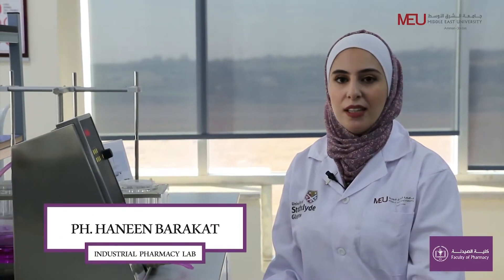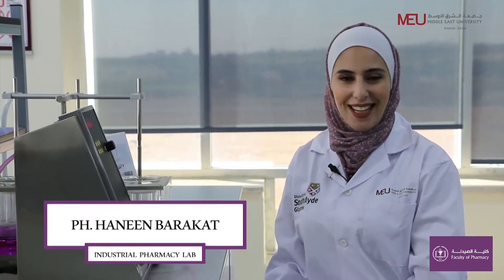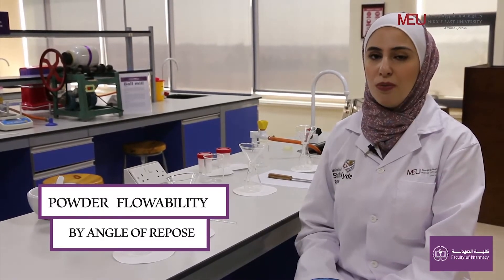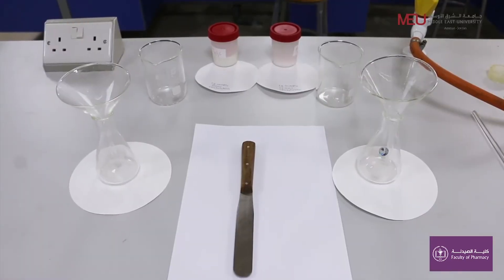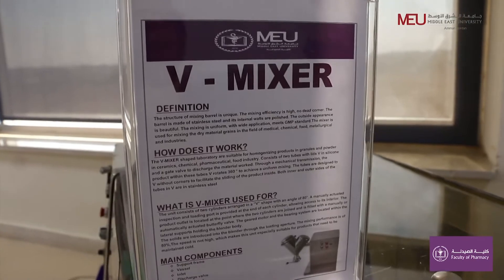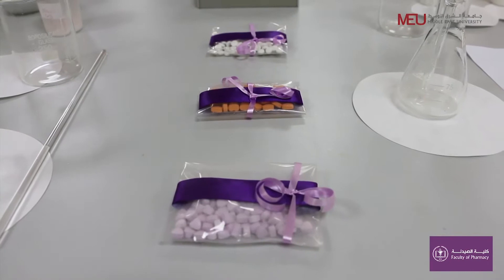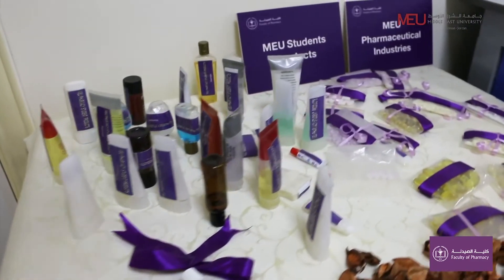Welcome to the Pharmaceutical Industrial Lab from Faculty of Pharmacy, Middle East University. This is Pharmacist Hanin Barakah. Our experiment is about mixing of powder by three different techniques: spatulation on paper using a spatula, trituration using mortar and pestle, and tumbling using a V-mixer. The main aim of powder mixing in pharmaceutical practice is to achieve dose uniformity in solid dosage forms.